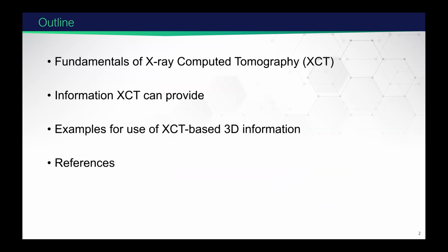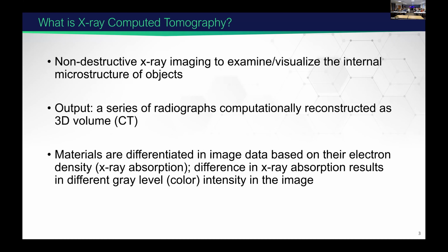My outline is I'll tell you about the fundamentals of X-ray computed tomography, or XCT, then a little bit about the sort of information it can provide for us, and then end with some examples of the applications of CT data, CT-based 3D information. And then I have a slide of references for your records.